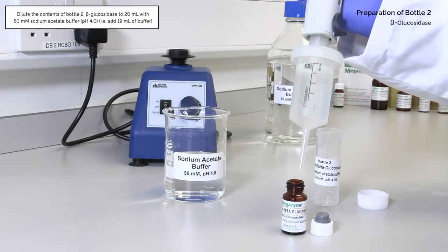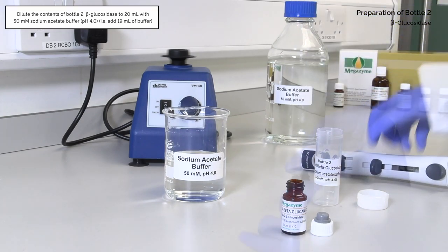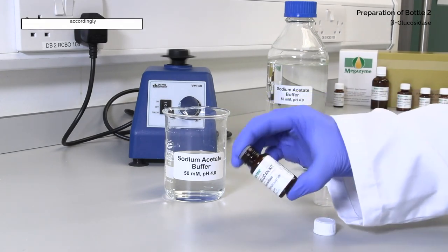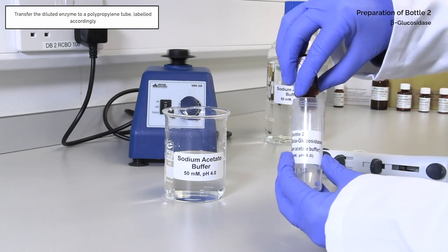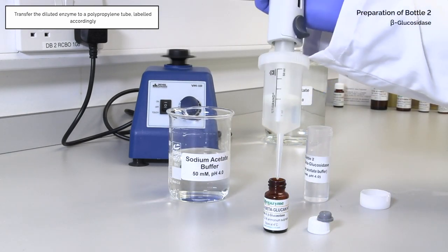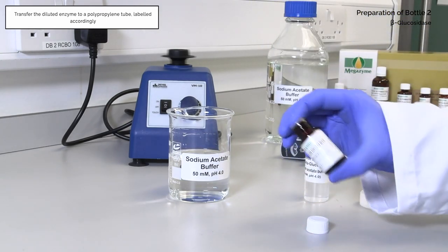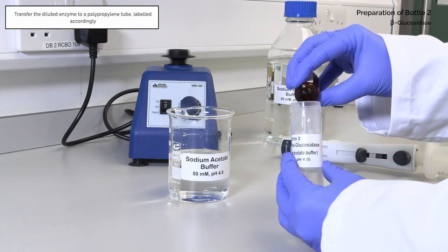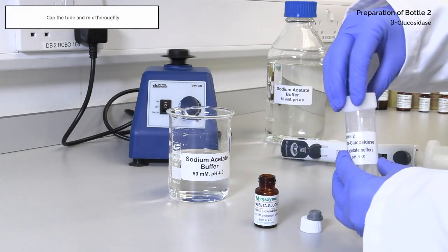The contents of bottle 2, beta-glucosidase, are diluted to 20 milliliters with 50 millimolar sodium acetate buffer pH 4. The diluted enzyme is transferred to a polypropylene tube, labeled accordingly. Cap the tube and mix thoroughly.